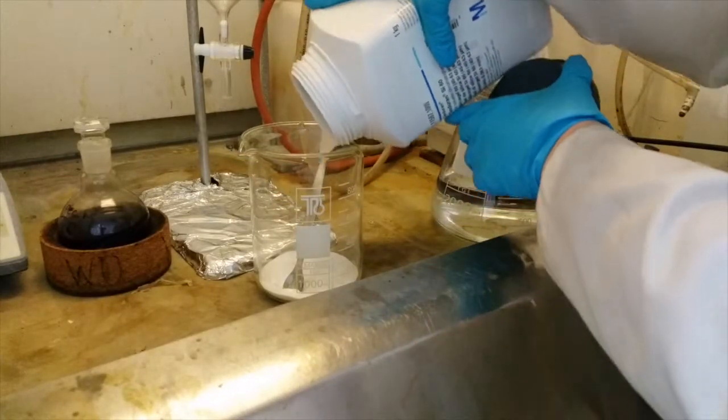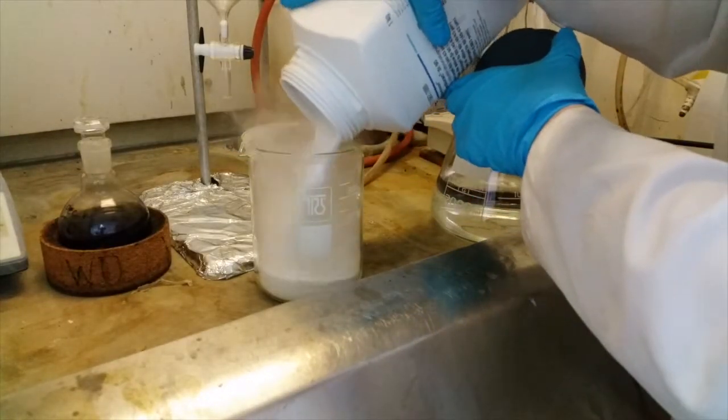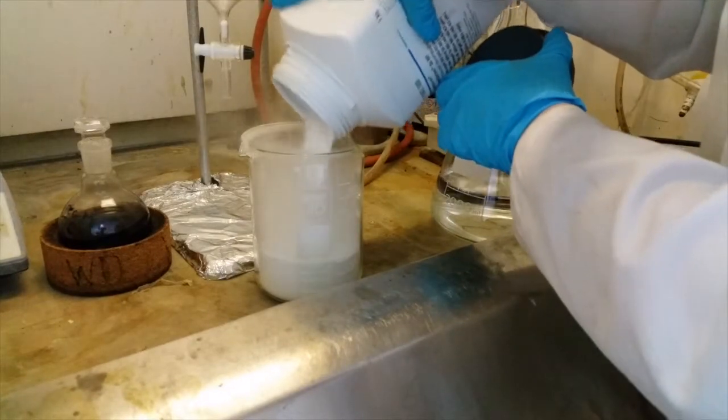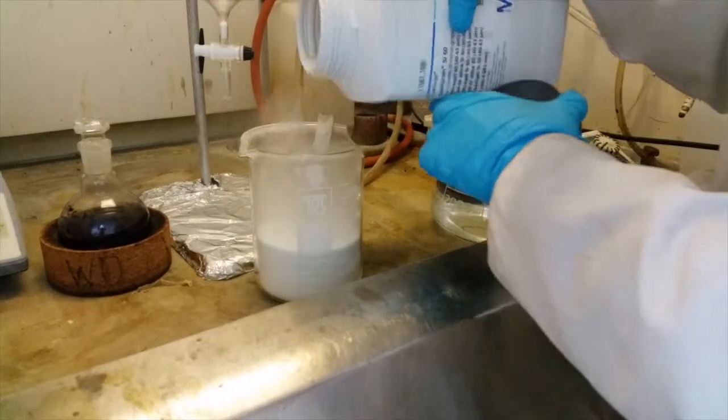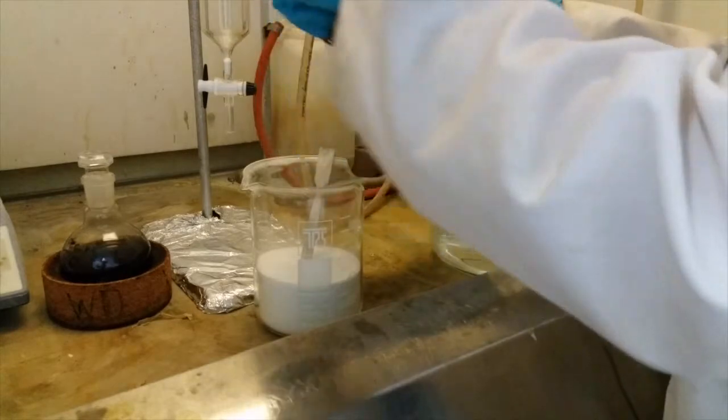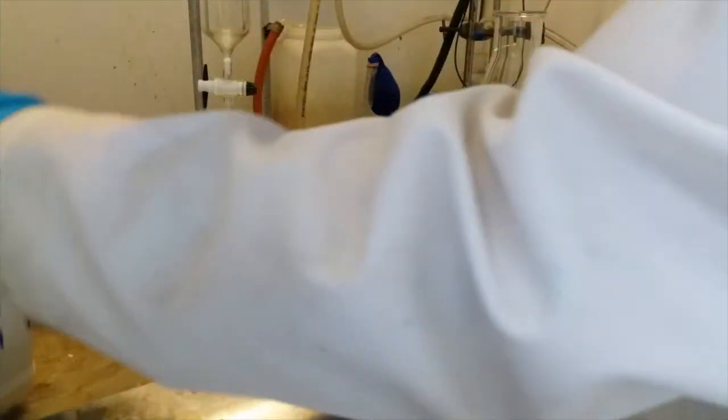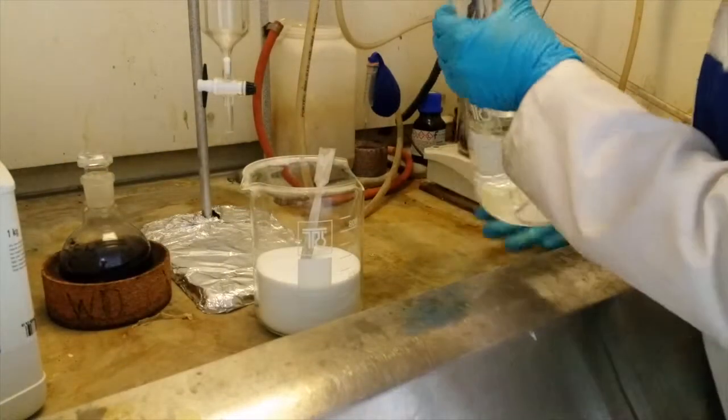Next you need to add the silica to your column. In order to do this we use a wet loading technique. To do this add the silica into a large one litre beaker. It's very important to do this step in the fume hood as the dust is very dangerous if you inhale it.